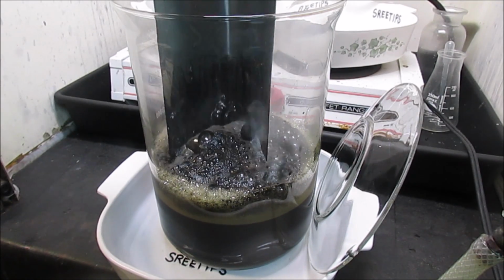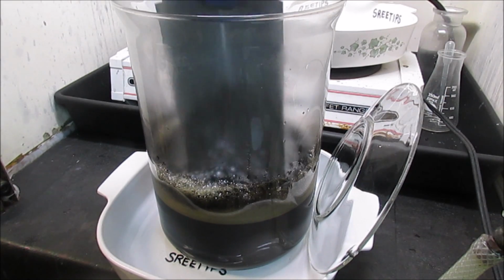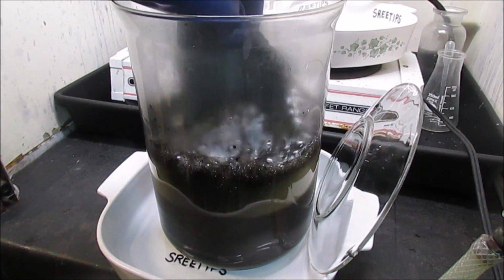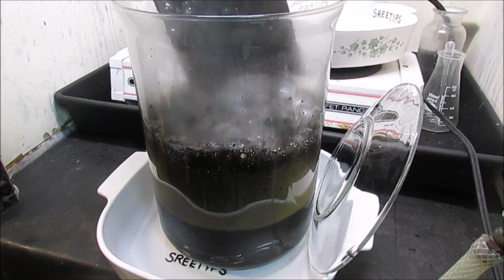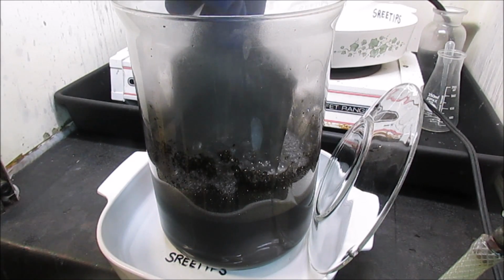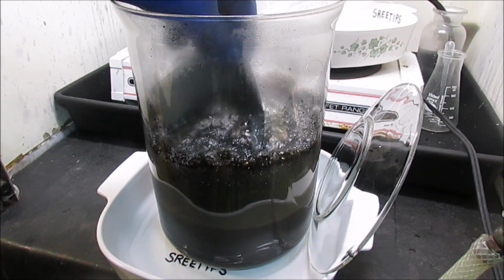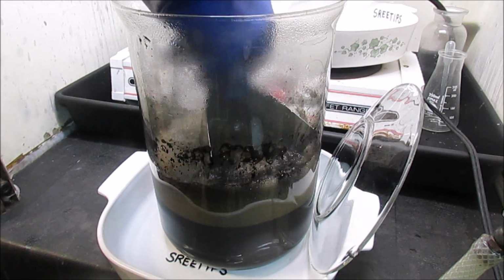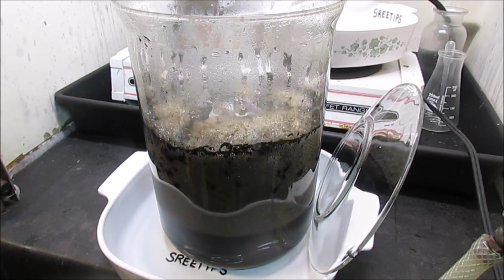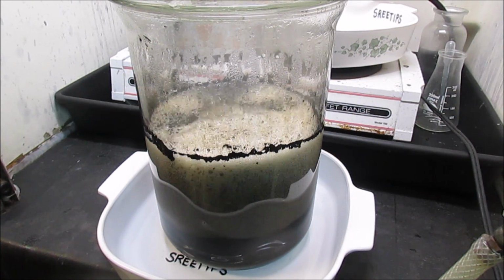You can see I get quite a reaction just by dipping it in there. That black foam is the platinum group metals coming out of solution onto the piece of zinc. The reaction happens very quickly, and the zinc goes into solution while the platinum group metals come out of solution as a black powder. You can see that black powder building up around the edge of the beaker there. That is the platinum group metals.